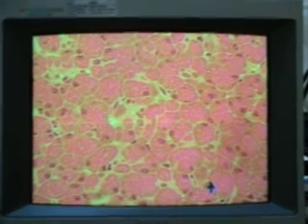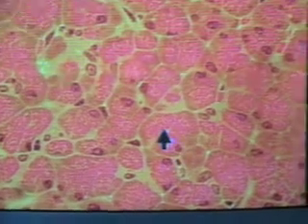Well, let's spend a little time just looking at the acinar cells here. This is 20x, and we'll go to 40x, and we'll look at these cells. You can see them. They're beautiful, and you see the very granulated material in the acinus, for example. You can see all the very dark, pretty pink granules.